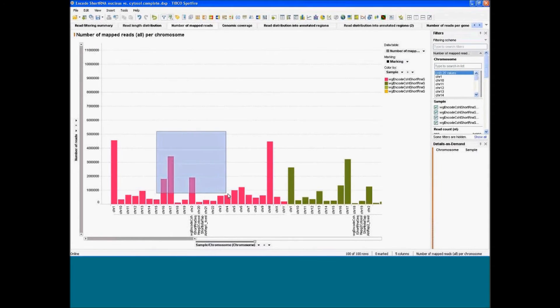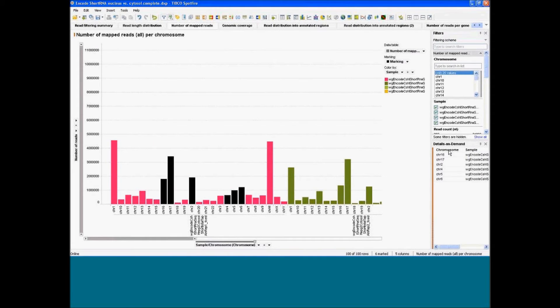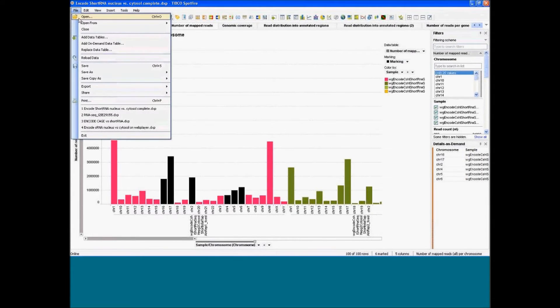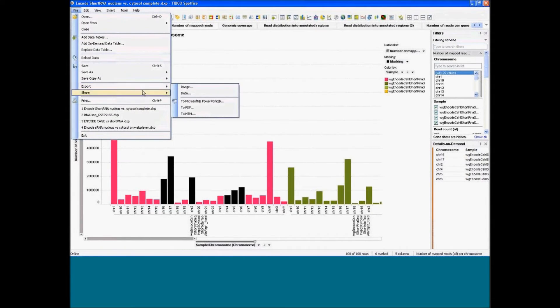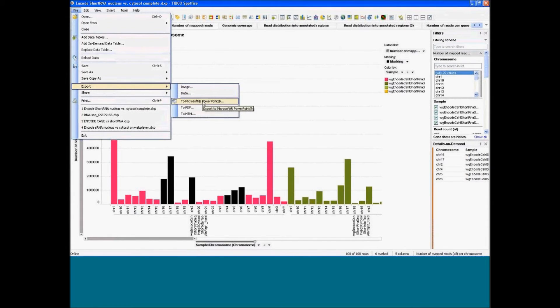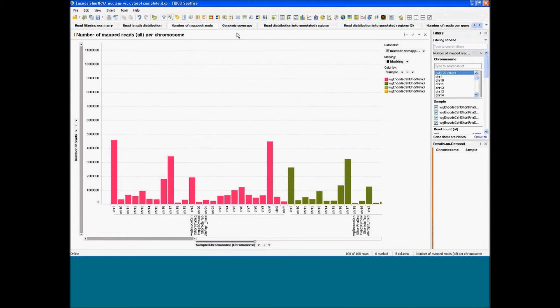Each time you select a data point, you have values displayed in details-on-demand. If you want to export results, you can export a picture, a PowerPoint report, or PDF report from all the pictures of your project.